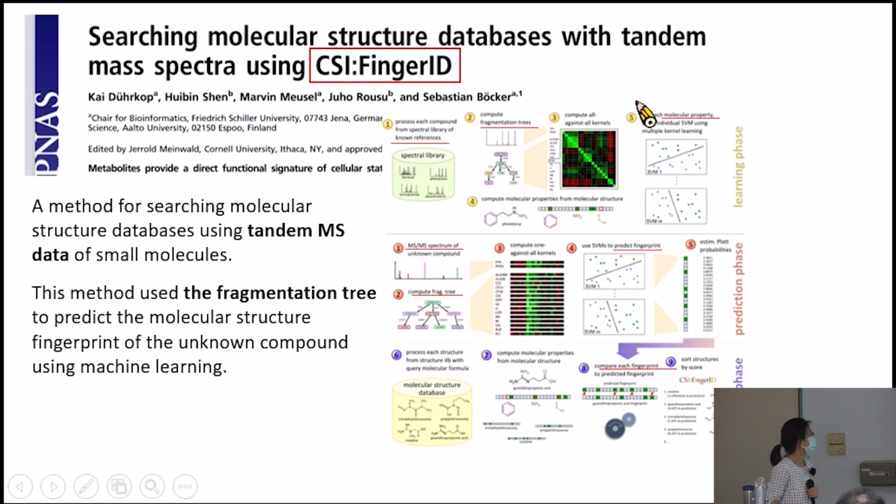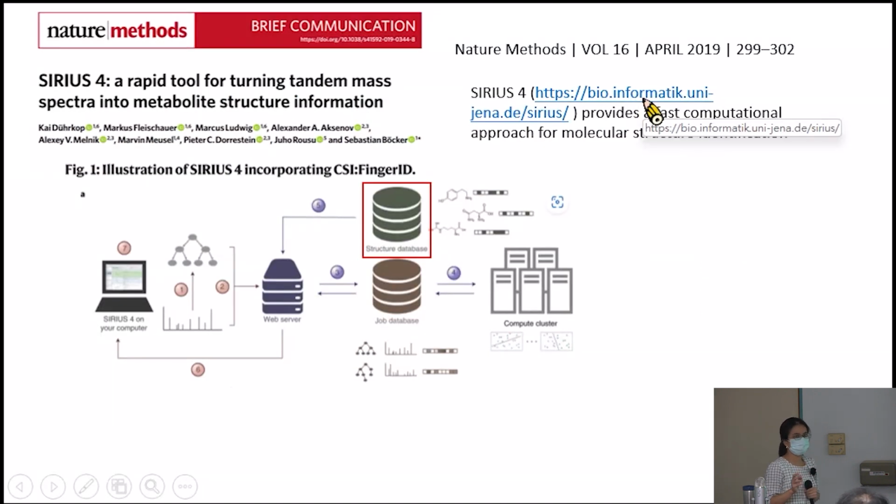Okay. So this approach was upgraded in 2019. In this paper published in Nature Methods, you will find that the authors incorporated the CSI:FingerID platform into SIRIUS 4.